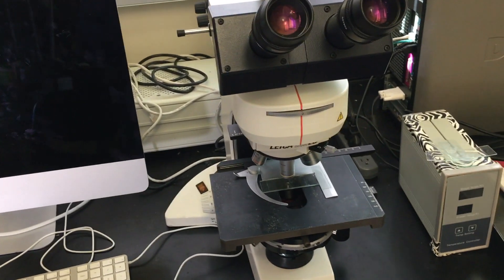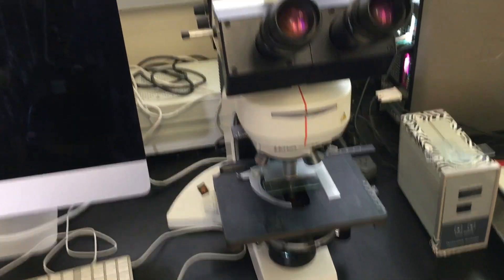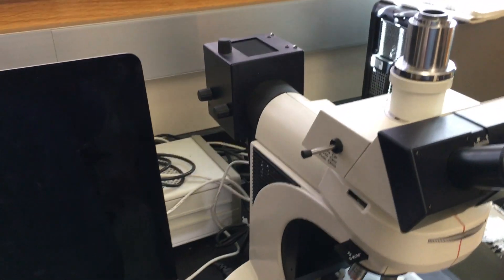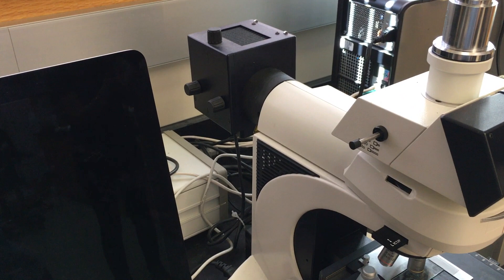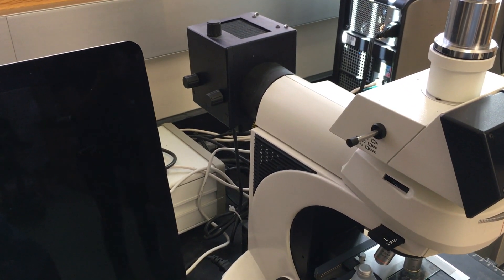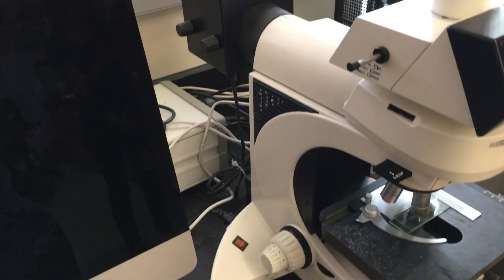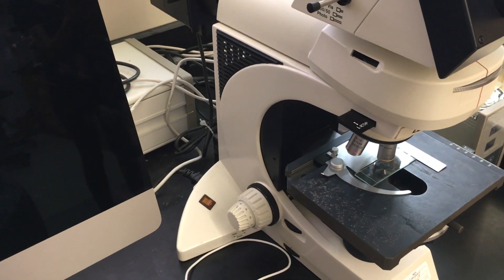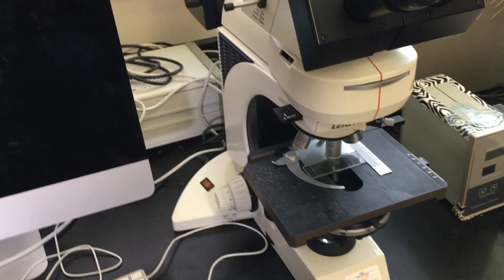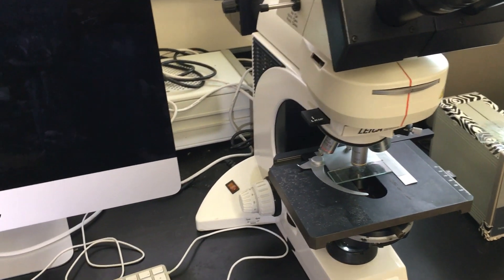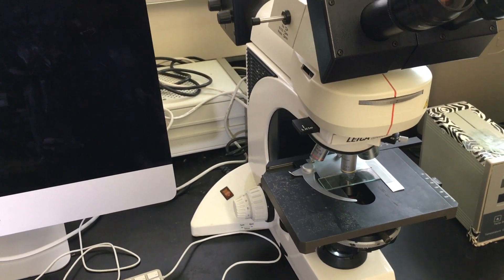Nice features about this microscope: I've got a warming stage, you see back there epifluorescence - we've got a couple of filter sets in there. It's also got DIC, Nomarski DIC, all the usual stuff.